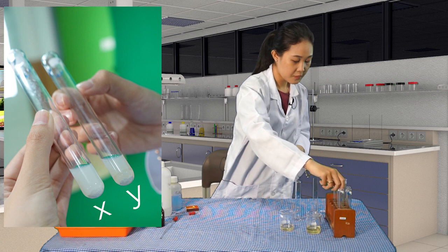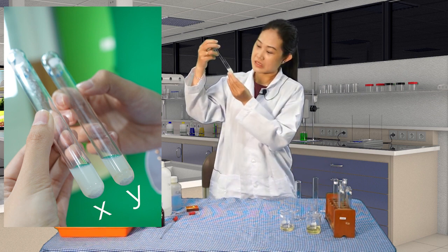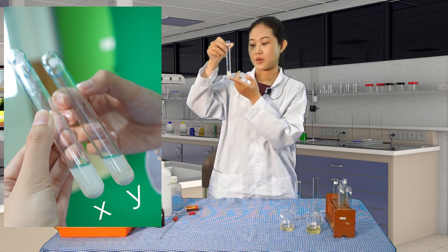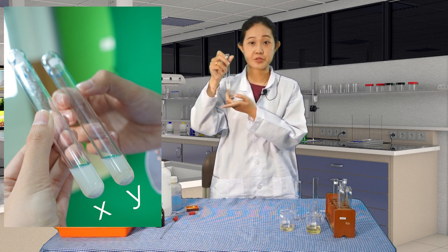With the sample Y, there is a little bit of precipitation as well, and the color is also whitish and milky, meaning this is also normal.